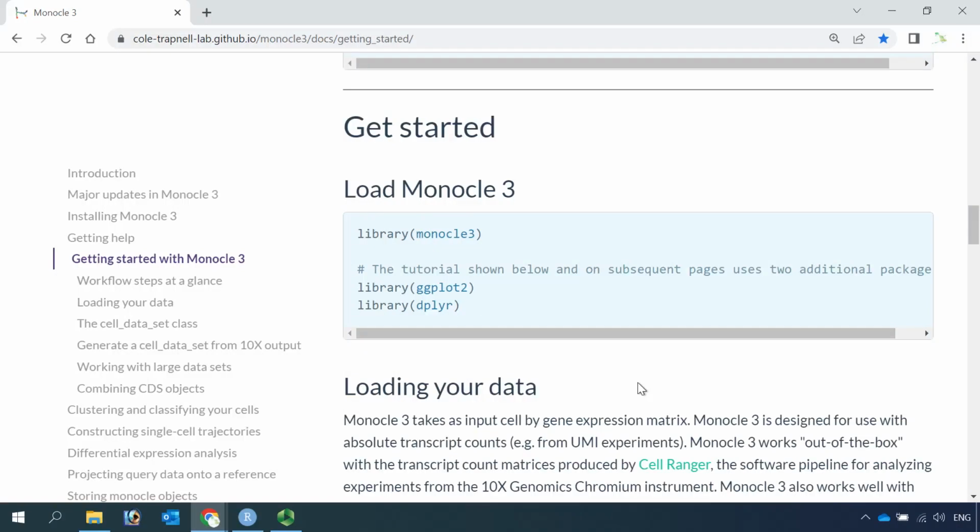The first thing to do is to load the data into R. For me, if you can load your data correctly in any analysis, the rest of the analysis is not difficult. You just need to understand the functions of the packages. You can copy code from online tutorials to perform the analysis.